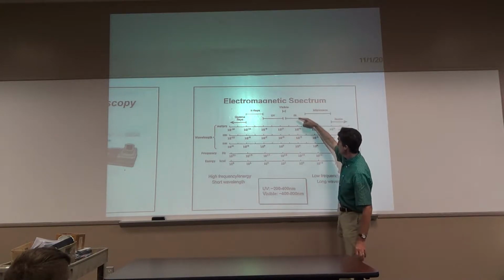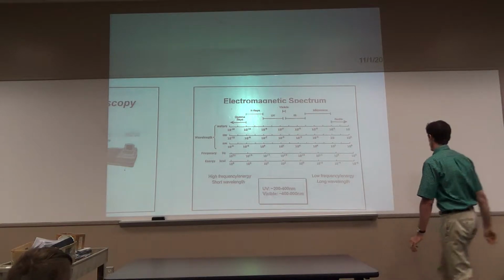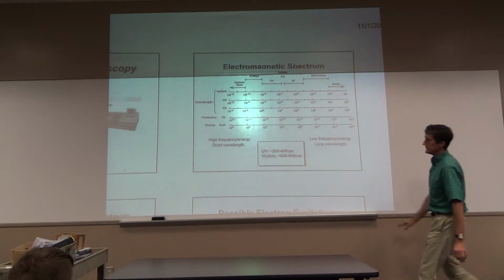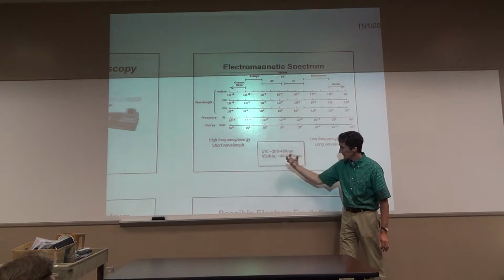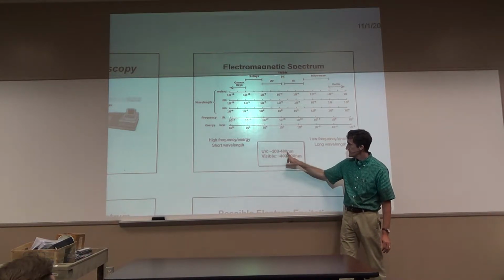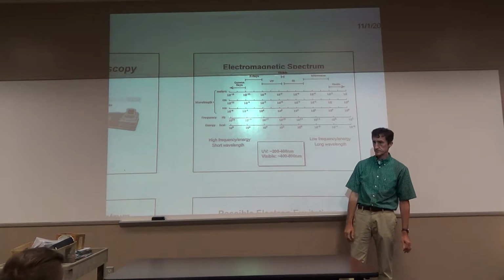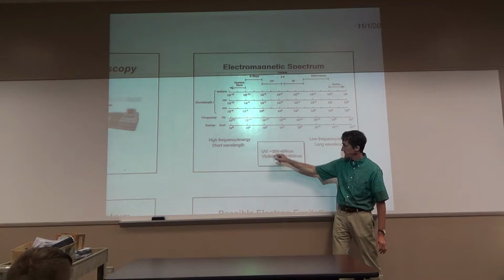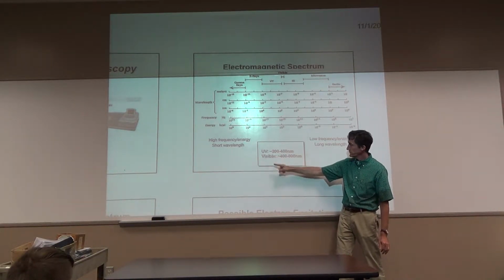Where IR is typically done in centimeters. You could do it again in any unit. Typically, though, your UV is about 200 to 400 nanometers. This is your practical UV that you typically scan. When you get above 400, you're then moving into the visible. Visible is about 400 to 800 nanometers. Longer wavelength because visible is lower in energy than UV. It's the UV of the sun that's most harmful, not the visible light from the sun.